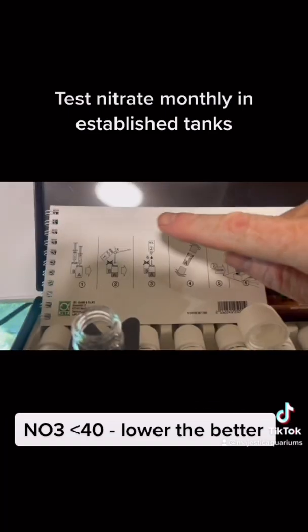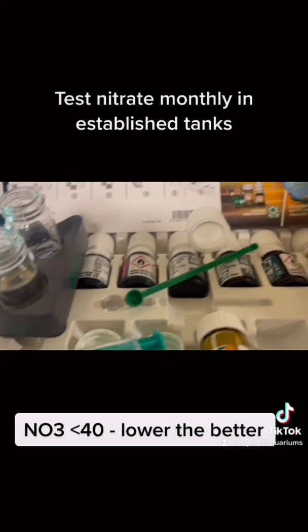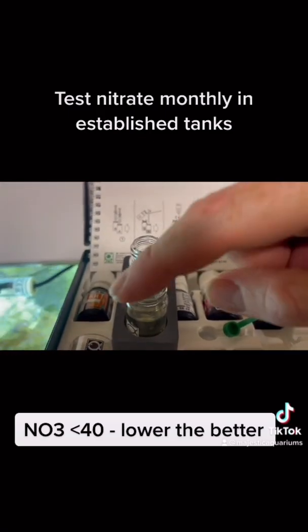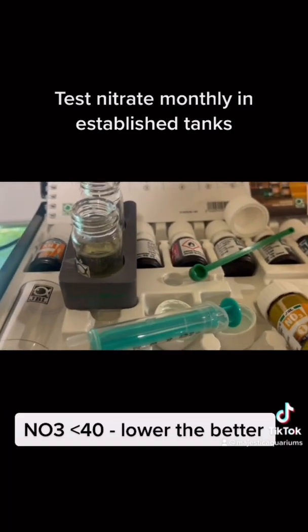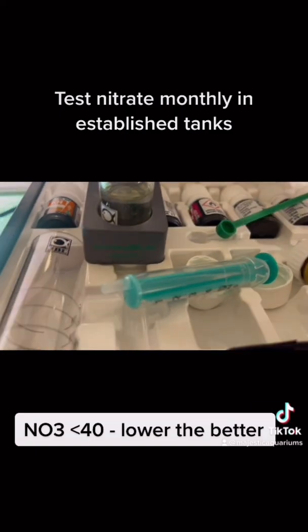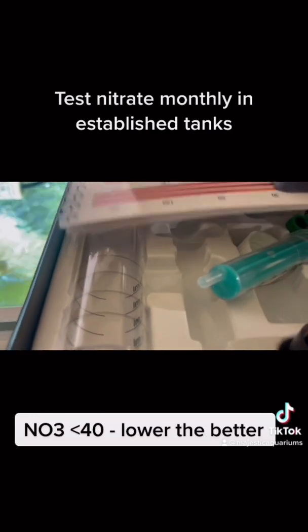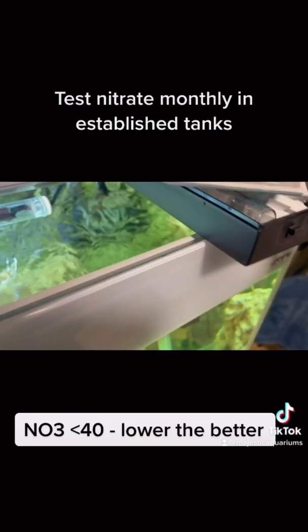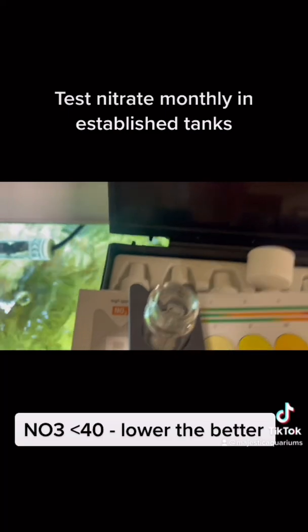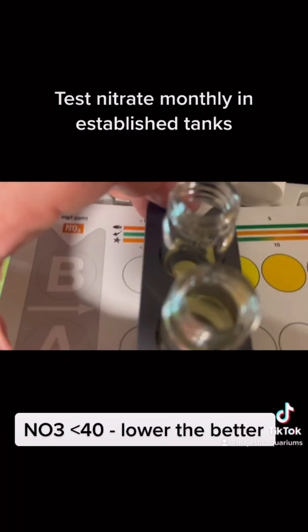Then we grab this one, which says NO3 2, and that's saying 6. We give it a shaky shake. Then we put in 6 drops. Then we give that a shaky shake. Now we need to compare the color. So we swap that over like this. We grab our little color thing. It's upside down. So now what we're going to do is put our little thing on here. Now we're going to look down here. It's very high for me on the top of this tank, and see what color it lines up with.